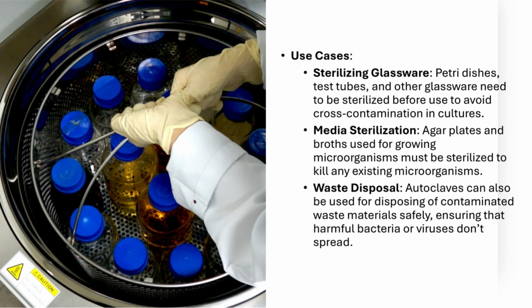Sterilizing glassware. Before any experiment, it's essential to sterilize tools like Petri dishes, test tubes, and other glassware to avoid cross-contamination. The autoclave ensures that all these tools are free from unwanted microorganisms before use. Media sterilization. In microbiology, we work with agar plates and broths to grow microorganisms. It's crucial to sterilize these media to kill any existing bacteria or fungi. Autoclaving the media ensures that only the microbes we introduce are allowed to grow.